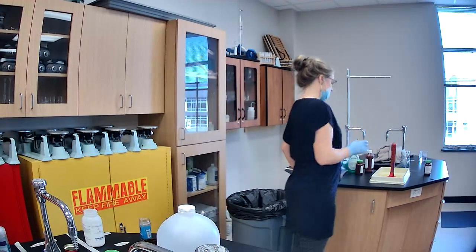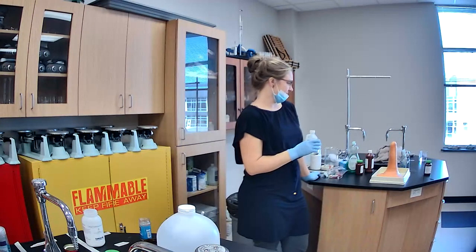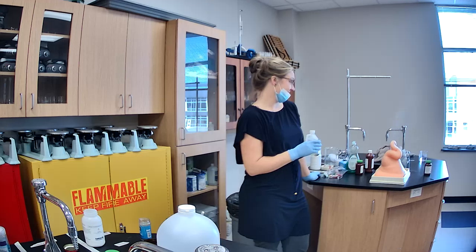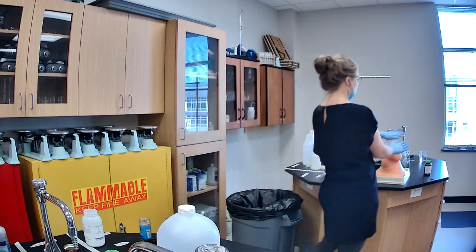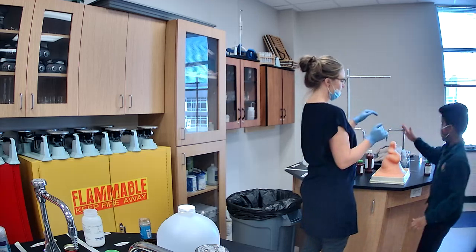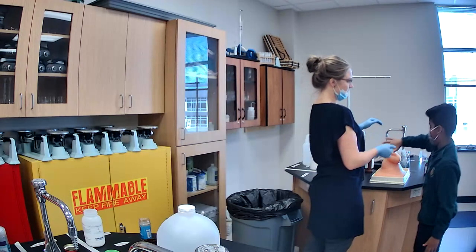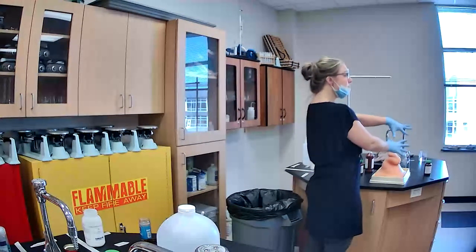Whoa! It's steaming because it's so hot. So Luke, don't put your hand right here. Don't touch it. Put your hand on the steam. How does it feel? It's warm. Alright, that's an exothermic reaction.